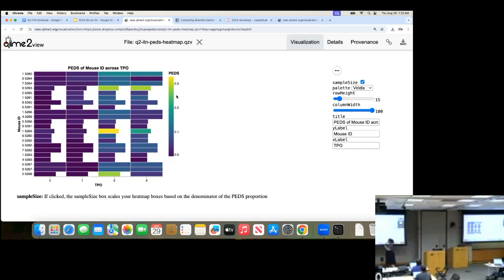Another student I'd like to point out is this one. He looks like he has the best engraftment of them all, and then it kind of fades. That doesn't necessarily indicate non-engraftment, but it does make me want to investigate him more. Just make sure that maybe he got that high alpha diversity that we're expecting and that he's not returning back to his baseline. Lastly, I'd like to point out these 2 right here.